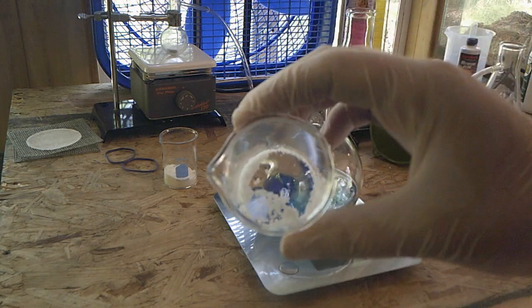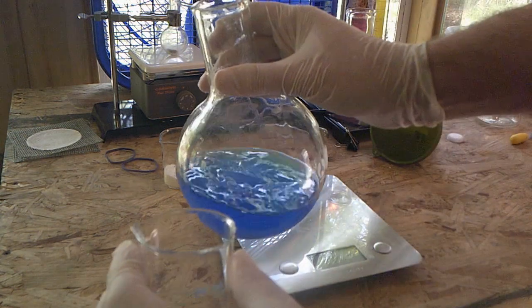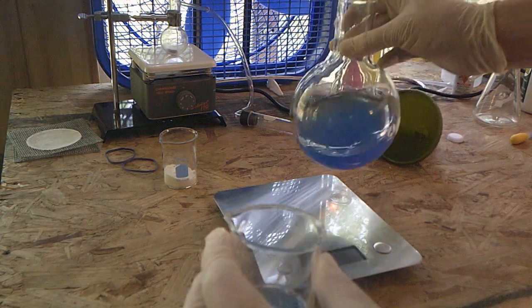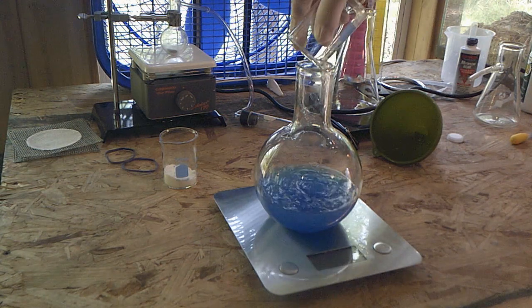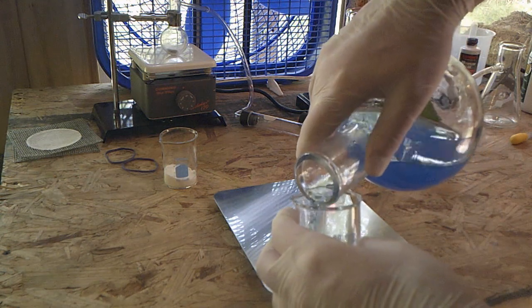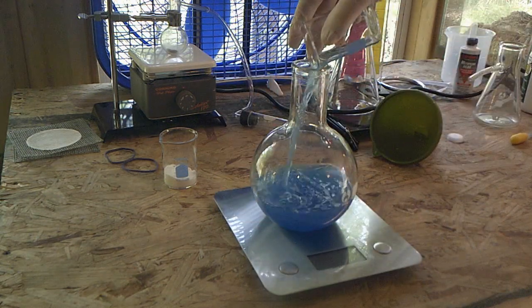So you guys notice how I have powder still in the bottom. That's because there's some moisture down there. Something you can do, rather than trying to scrape it in there, is you can just take your solution, pour it in here, let it dissolve that powder that was stuck down the bottom. Give it a little bit of a spin, and then now pour that in there. Let's do one more. These are called washes. We're going to do one more wash. And then there now. We got the rest of it out.